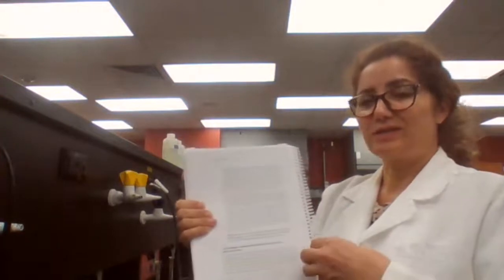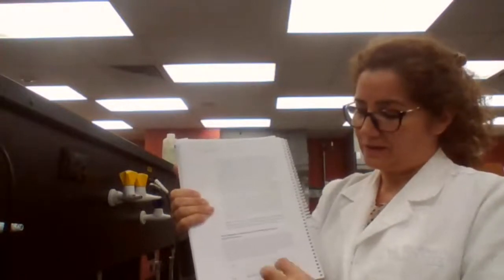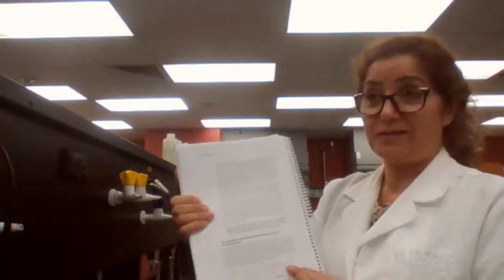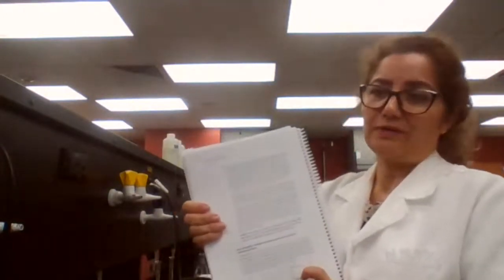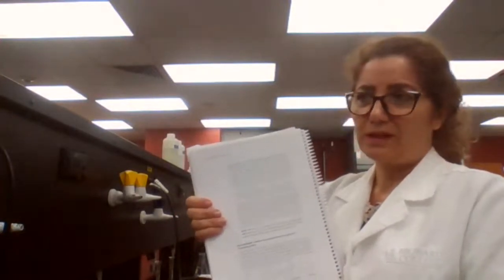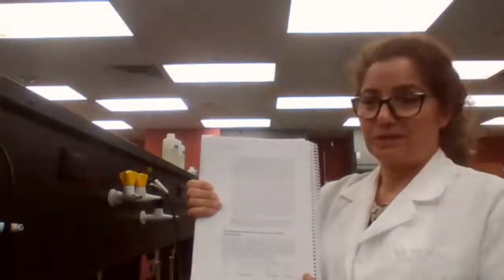When your reaction is complete, you have the product, but that product is not pure; it is a crude product. To recrystallize the product, you have to follow an experiment already designed based on the compound that you are trying to purify. Or if you don't know the compound, you have to do a lot of trial and error in order to find the proper solvent, and you recrystallize your compound away from its impurities.